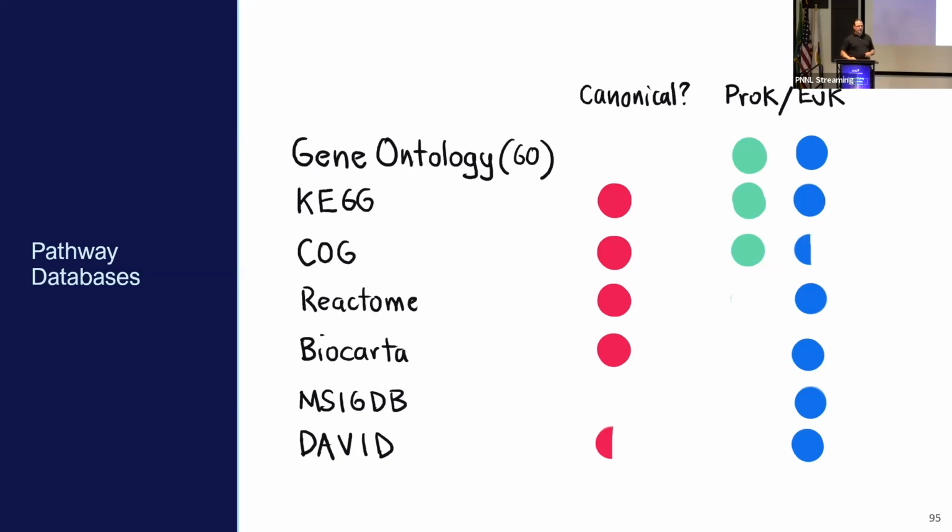And it's basically a hierarchy where the different pathways or the different groups are at different levels. So you can have things as broad as enzyme, right? Is a protein, what's a protein's function? It's an enzyme. Somewhat useful, probably not useful if you're trying to interpret your big pile of differentially expressed genes, right?